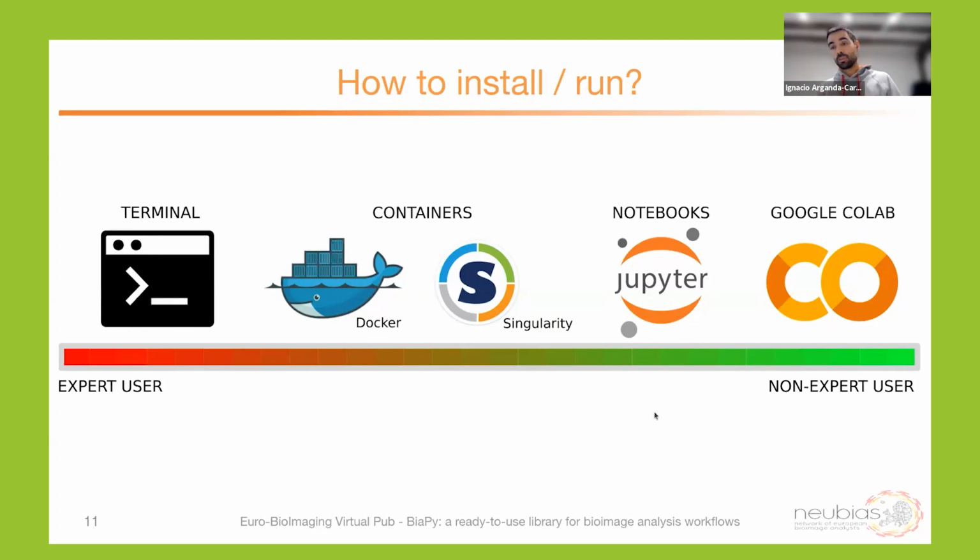And also for people who are not that familiar with that type of installation, we have notebooks that follow the successful zero-cost deep learning for microscopy philosophy, where there's no code, you just have to edit different menus. And we can also run them in Google Colab with real data. Of course, depending on your data, this may not be ideal. If you have very large data, you may have to jump into a local installation.